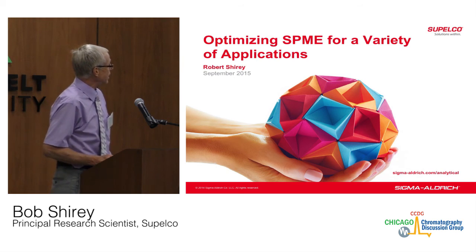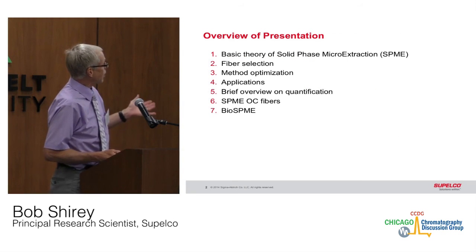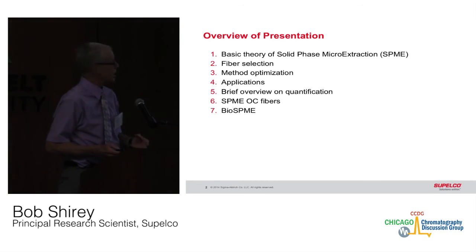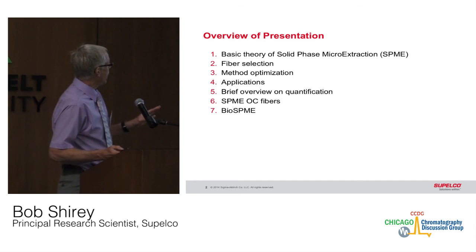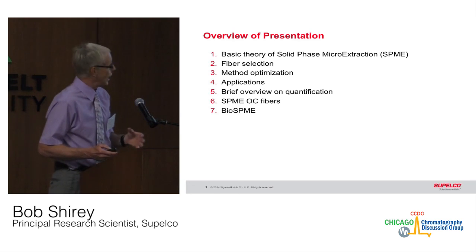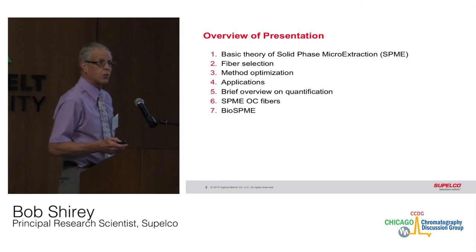Today I'm going to talk about SPME and hopefully give you some insights on how we can optimize SPME. I'm going to briefly go over some basic theory. I understand a lot of you are already current users, so the beginning section I may go through relatively fast. Fiber selection, method optimization, applications, and a brief overview on quantification. And then look at some new products, SPME overcoated fibers, and SPME for solvent desorption, either way you want to look at it, so it can be interfaced with HPLC.